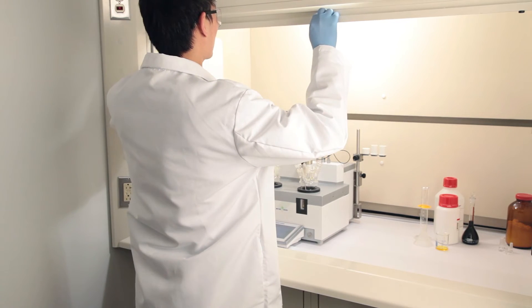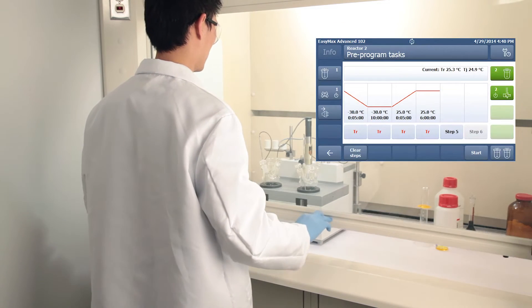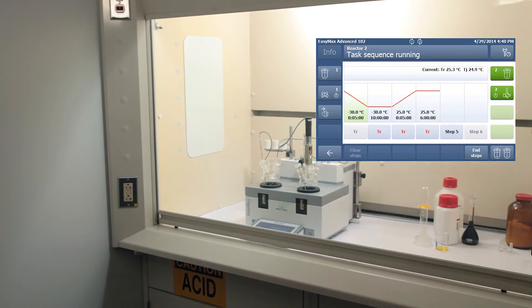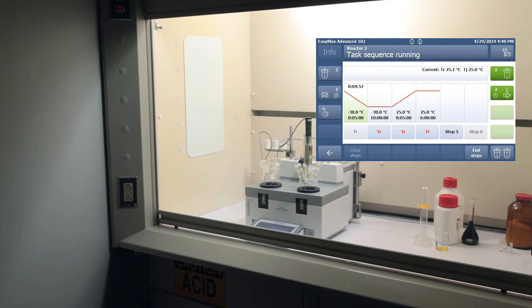Unattended 24-hour control is now possible with the ability to pre-program changes in temperature, mixing and dosing parameters while maintaining a safe working environment even during exothermic reactions.